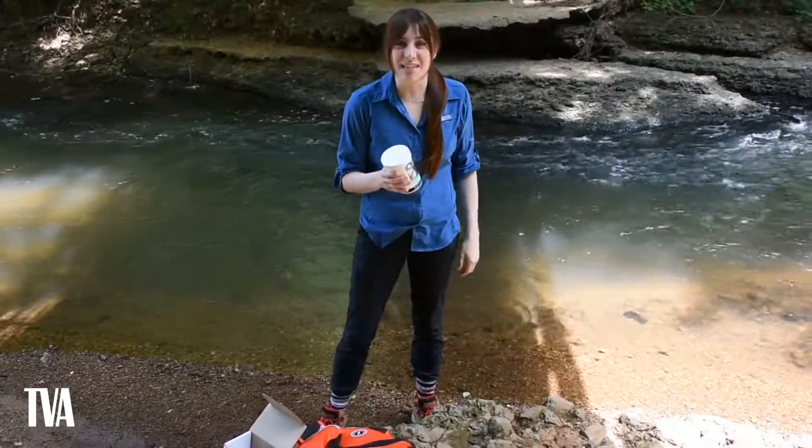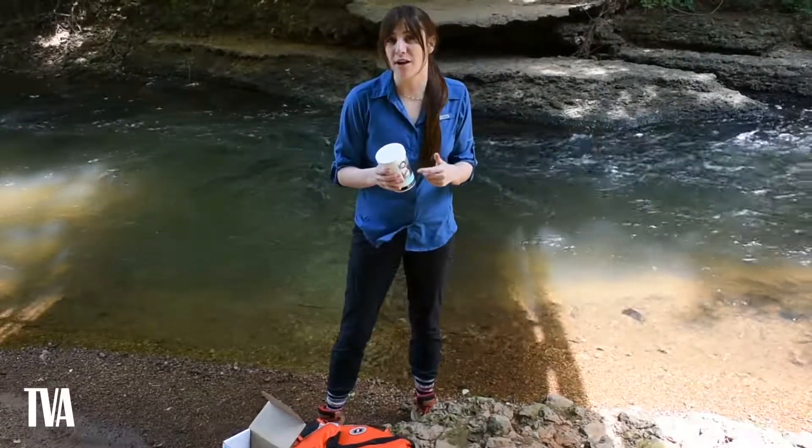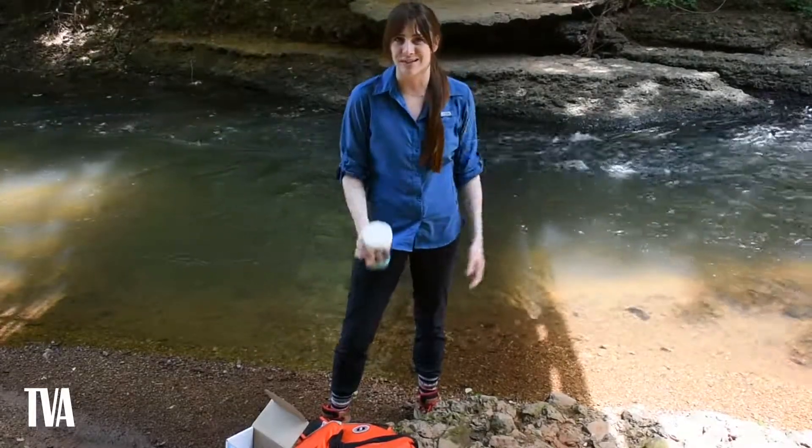Hi, my name is Jessica and I work with TVA Science Kids. Today we're going to be testing our World Water Monitoring Water Quality Kits streamside. But before we go over the test instructions, I'm going to go over some safety guidelines.